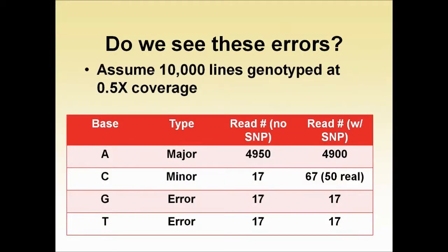So do they matter, these errors? Are they a 1% error rate? Well, in maize we do lots of sequences, up to 50,000 lines now. But at the time this slide was made, it was 10,000 lines. Some people also do higher depth GBS, like with a 6-base cutter, and they get a lot more reads, so you start to see the errors.